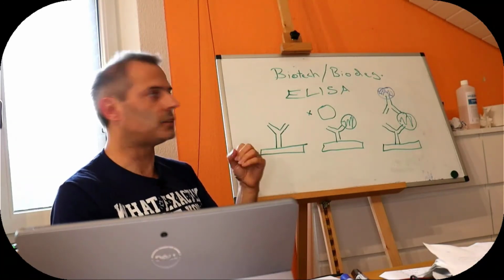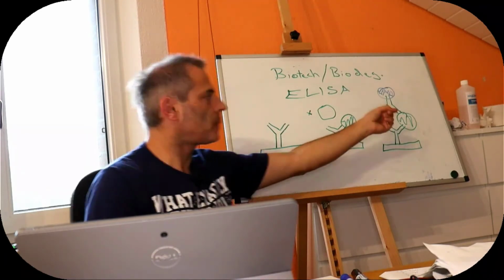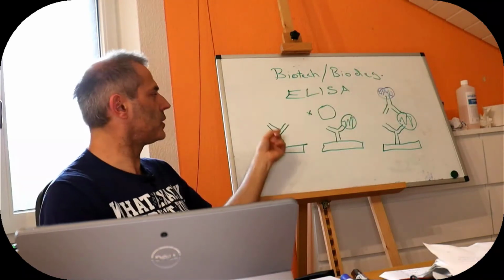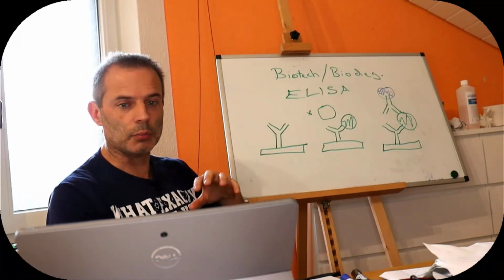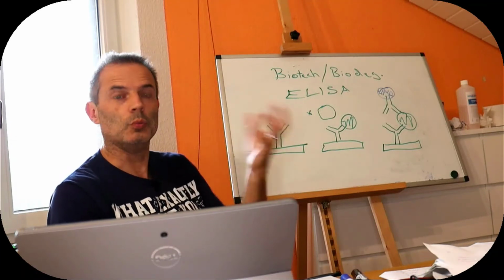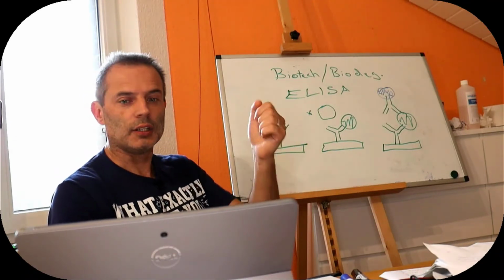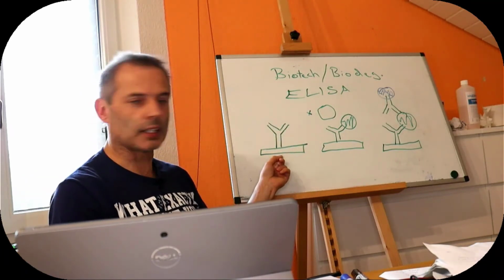So now we have a system where we can measure lower concentrations by just giving the enzyme longer, and we can measure higher concentrations by diluting our sample, and because it's outside the body and in a 96 well plate, we can do all of that all at once. If you watch pretty much any news program, eventually you will get a picture of somebody pipetting into a 96 well plate, and that is exactly this.